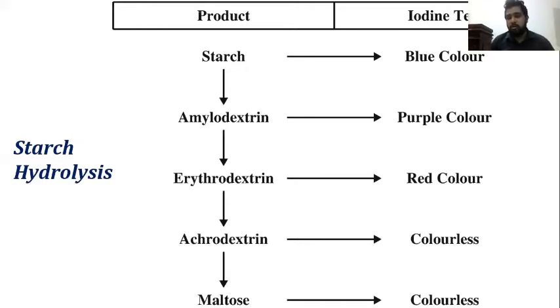Dextrins, all the dextrins contain some carbonyl groups. Then technically they can act as reducing agents, but not as strong as maltose or glucose. Technically they can give positive results for the Fehling test. All the dextrins contain some form of carbonyl groups.